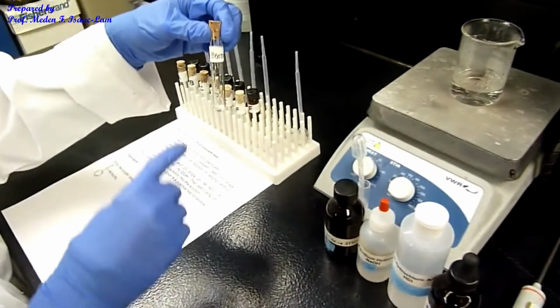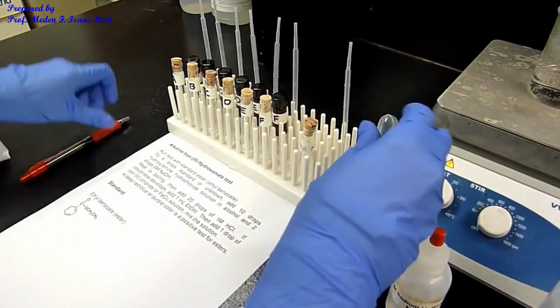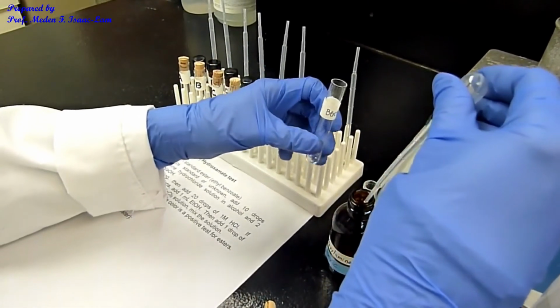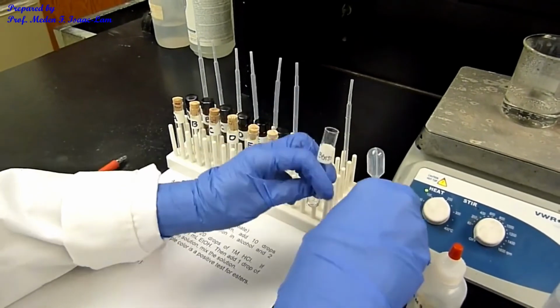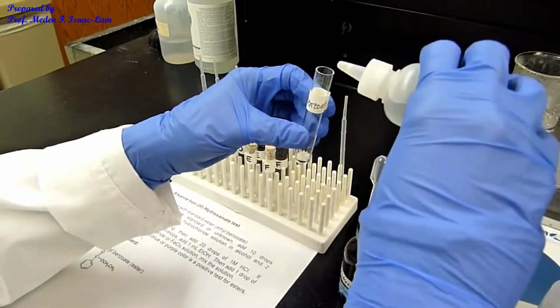So I have the standard, which is ethyl benzoate. So hydroxylamine hydrochloride, I'm going to add 10 drops. And then I'm going to add 2 drops of sodium hydroxide, a base.